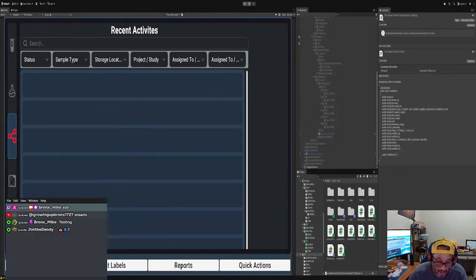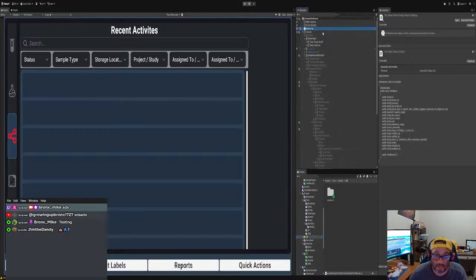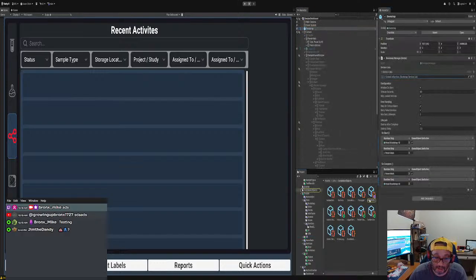So we have our sample bootstrap services. No, that's not it. Types, utility, forms. What did I put that at? I got too many folders. Menu data. You know what? I could find it easily with the bootstrap. And then that. There we go.